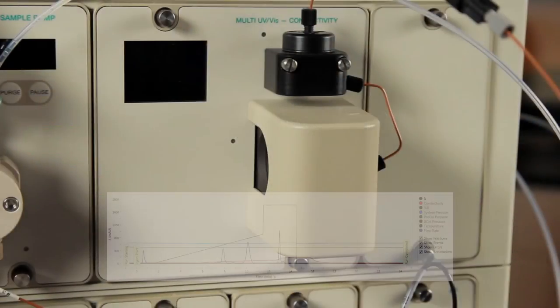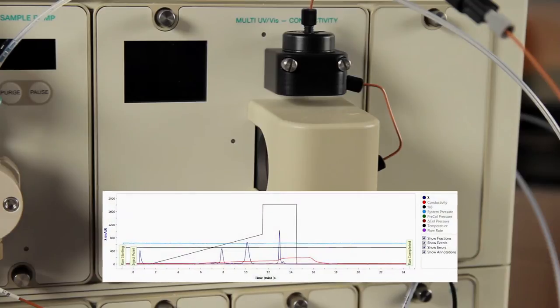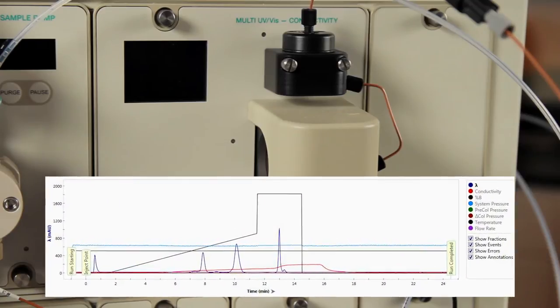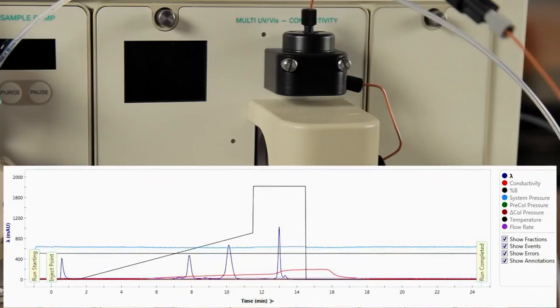Occasionally, you may notice that the UV baseline on your NGC is unstable or noisy. Very often, the drift is due to insufficient warm-up time or bubbles in the flow cell.